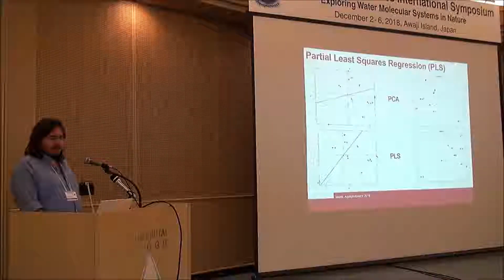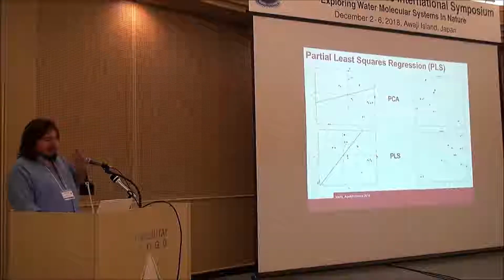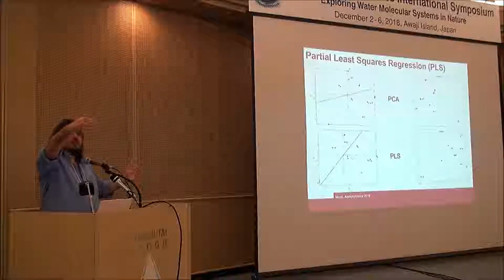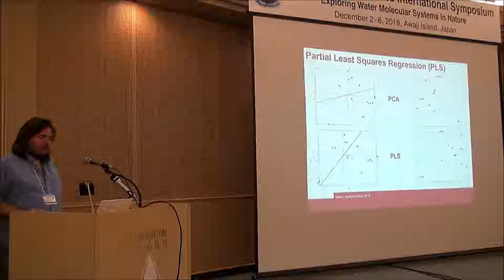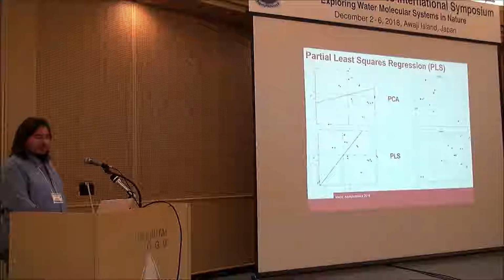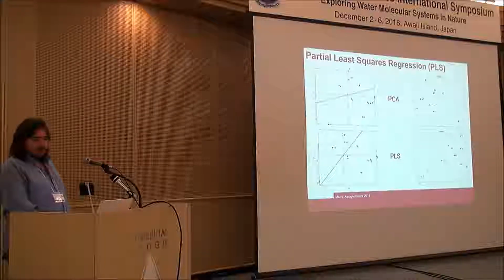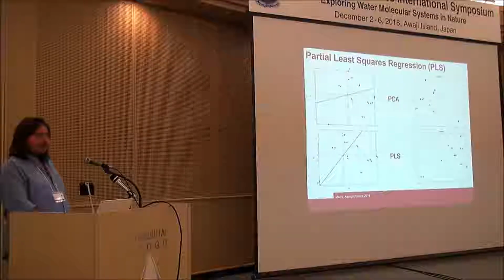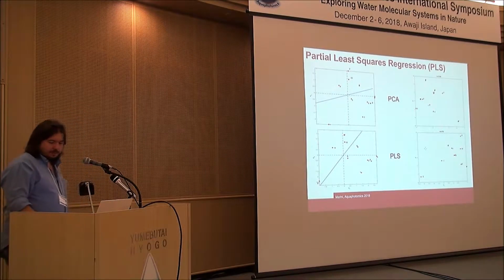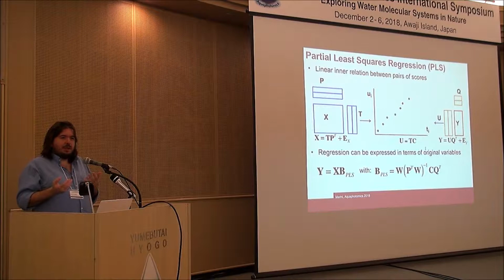These loadings, this first latent vector in PLS, account for a good amount of variance in X, because it's still accounting for a relatively high amount of variance in X, but it also takes more into account the correlation with the Y. Now, if I plot the score and the Y, one as a function of the other, with respect to the first principal component score, in this case data are starting to be aligned along this direction. And this is the general scheme of PLS.